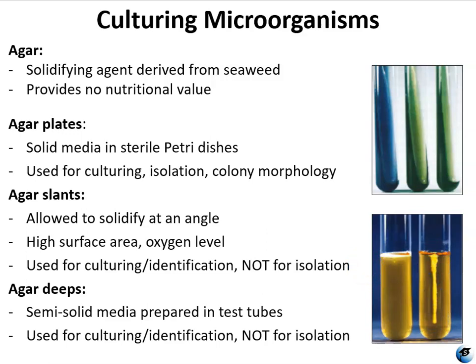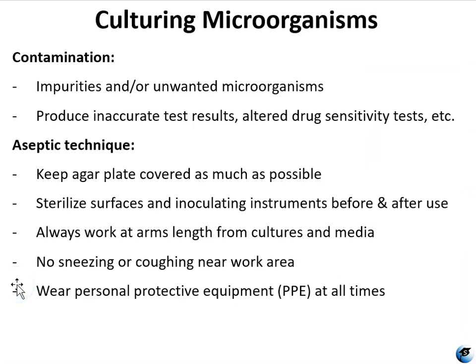Because microorganisms are ubiquitous throughout the environment, it's very important for students to learn early in this course how to use proper aseptic technique. You do already know about wearing PPE, but in addition to that, aseptic technique involves avoiding contamination of your sample, your workspace, yourself, others. And one very easy thing to do is to make sure that you keep all of your specimen and agar plates and things like that at an arm's length.